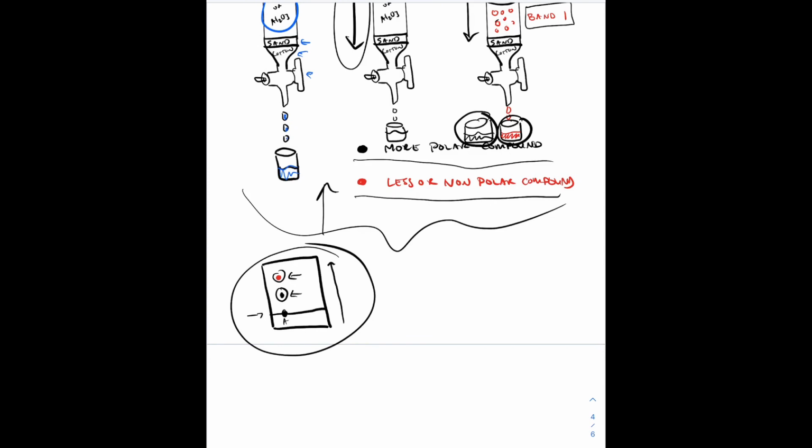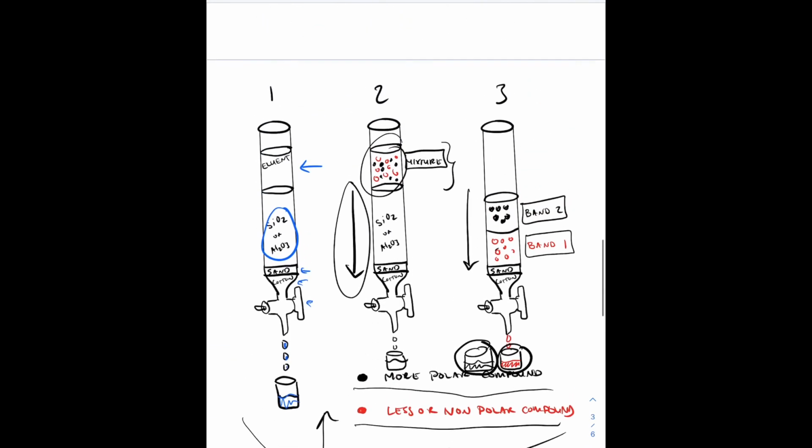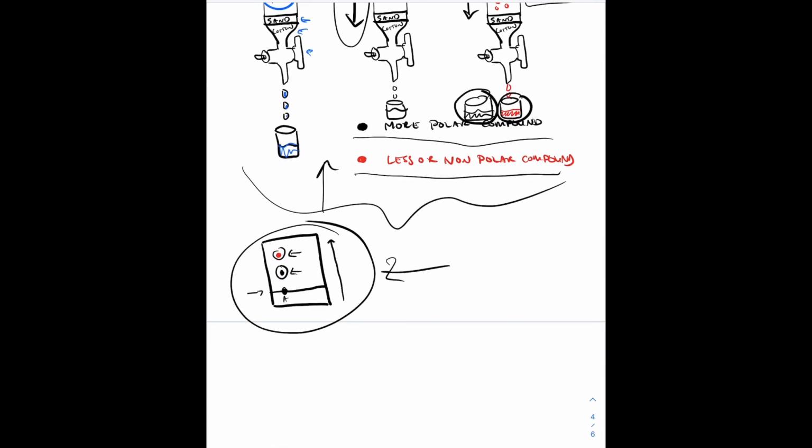Okay, and so the explanation as to how, more or less, the TLC works will come in the following video where I actually do the experiment. And so if it doesn't make sense, if you understand this, then use the information that I've given you for the column chromatography and directly apply it to the TLC. So there's a stationary phase and there's a mobile phase, but the only difference is that the mobile phase travels up the stationary phase as opposed to down the stationary phase. And that's going to be it for column chromatography as well as TLC, thin layer chromatography.